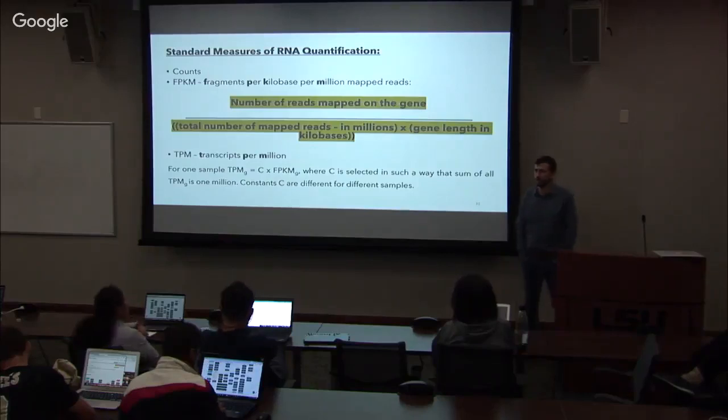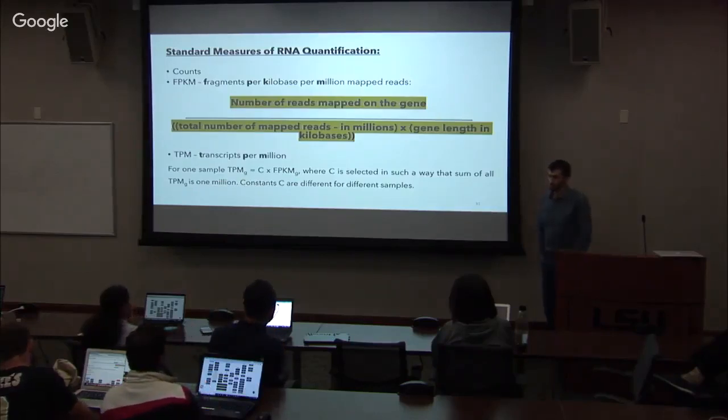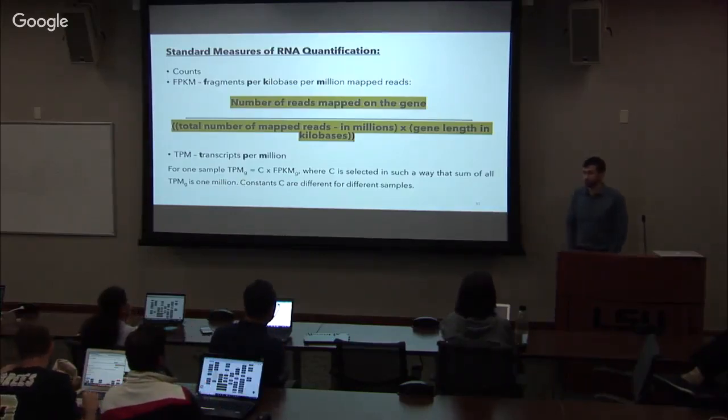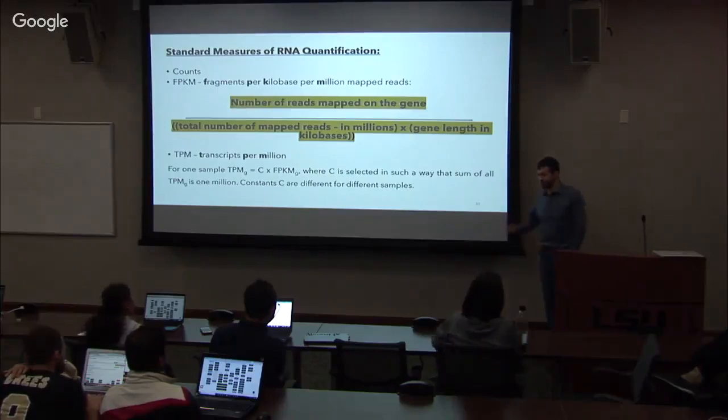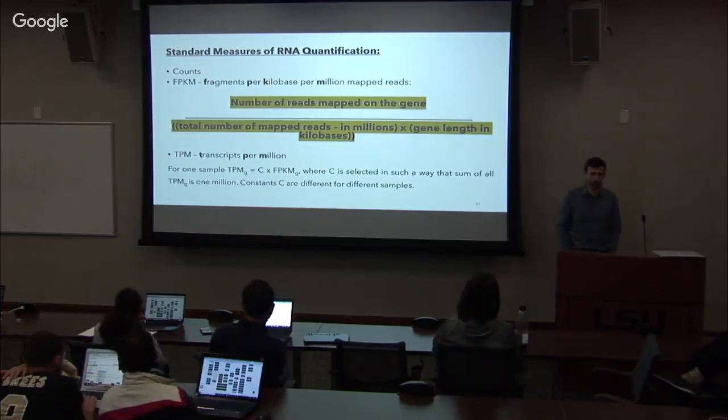That's a follow-up. I had the same question, but under what circumstances do we choose the single-end analysis? Like instead of choosing paired-end, when do you choose single-end? It's just related to what your source data is. If your data was prepared as paired-end, you can use paired-end. But if it was prepared as single-end, you can't use paired-end. Okay. So just based on what data you have.